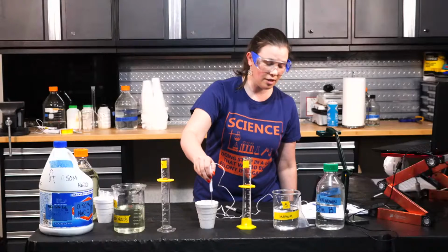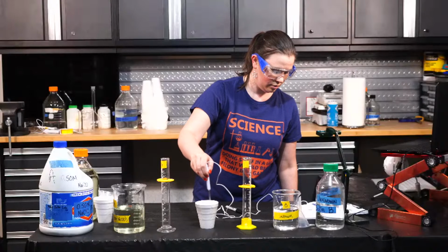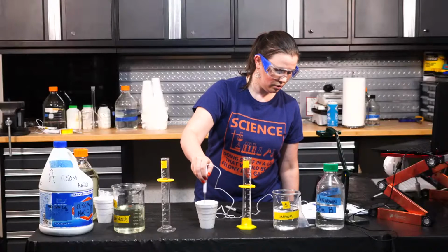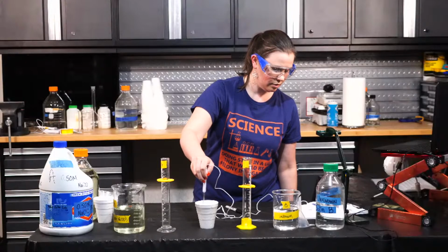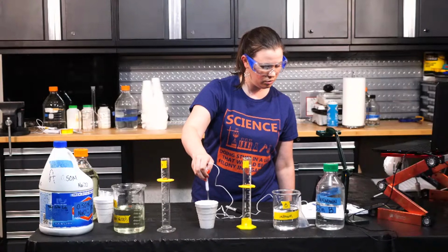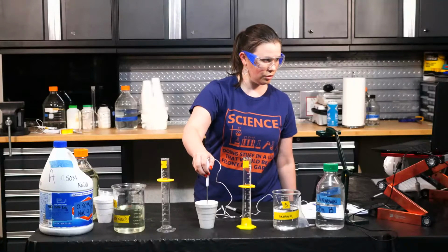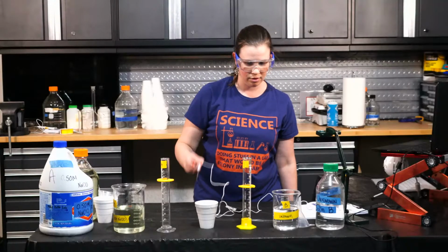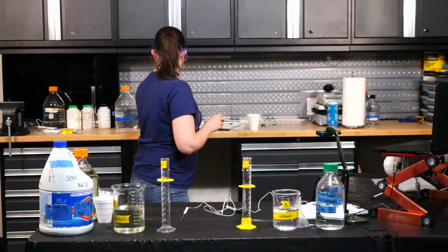Notice I'm mixing this in a styrofoam cup. There's probably a reason for that. Still at 25.6. And still at 25.6. So I'm going to call this the max temperature for level 2, 25.6 degrees Celsius, starting at an original 19 degrees Celsius. Level 2. I'm going to switch this out for a different cup now.